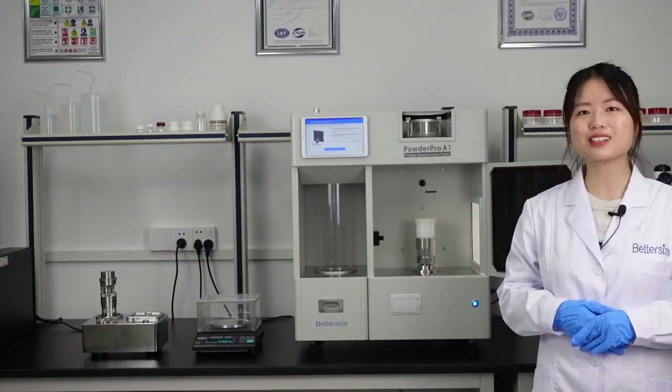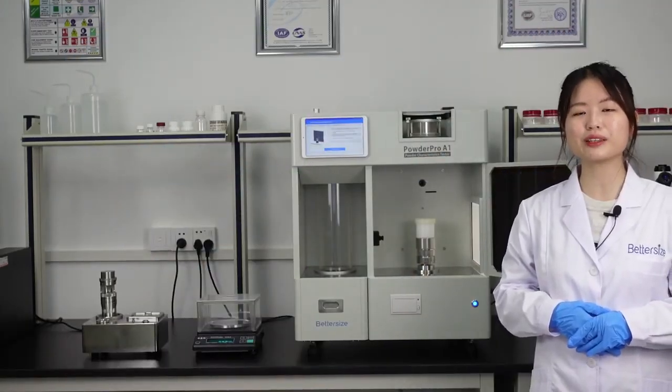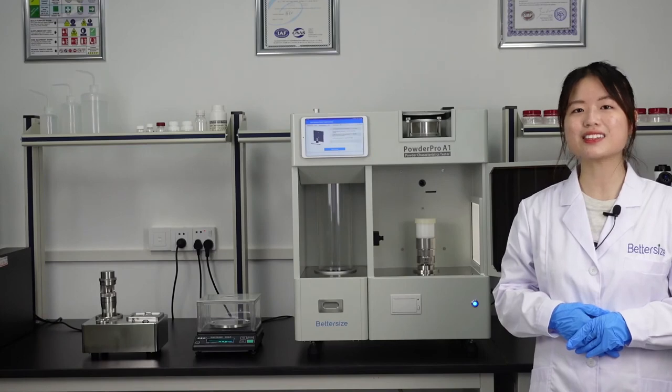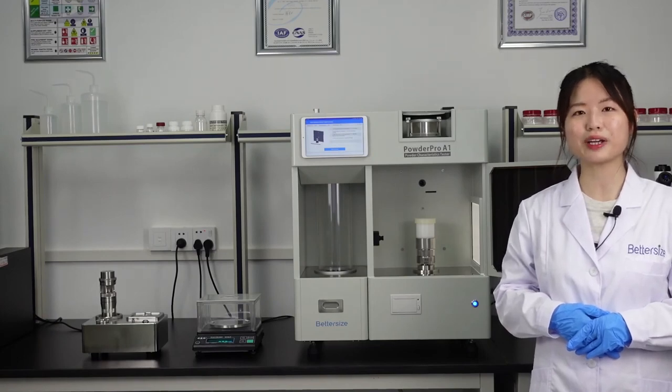So far, we have posted a series of videos including the measurements of Angle of Repose, Angle of Fall, Angle of Spatula, and Bulk Density and Tap Density using the Powder Pro A1.